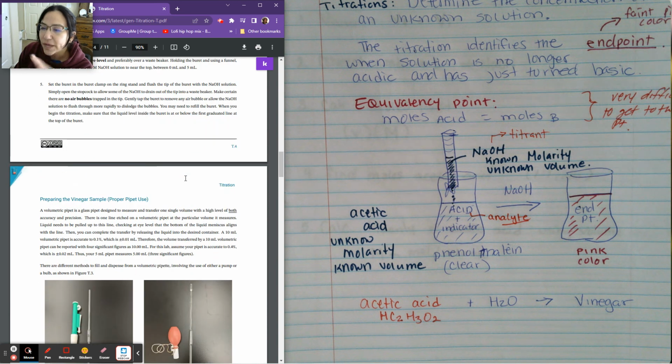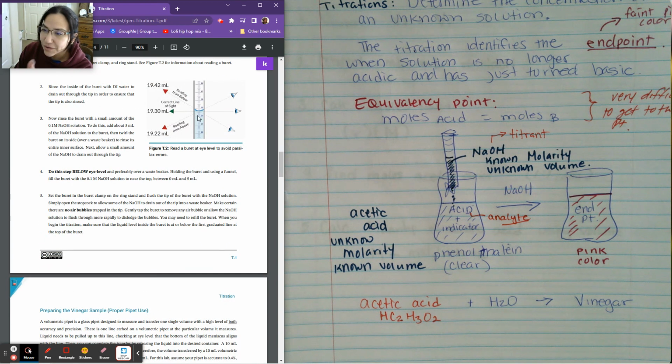Oh, sorry. I said that wrong. It took me a moment to think about it. All right, so the 19 is right here. And as you go down, this is 19.1, 19.2, 19.3, 19.4, and then you go down to 20, and so forth. So this is going to actually be like 19 point something else. If I could zoom in, I'd be able to see the number.